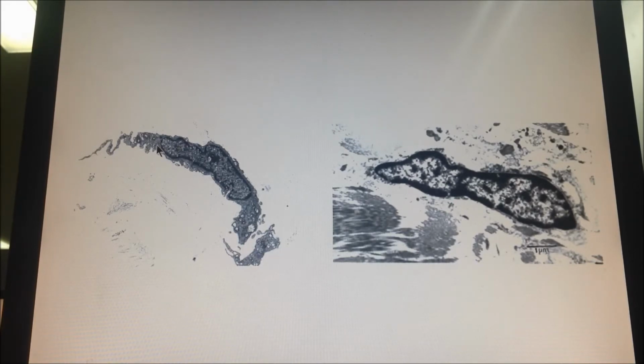فعشان هيك راح تكون السيتوبلازم فيه كل الاورجانيلز الكاركترستيك للبروتين سكريتنج سيلز. يعني راح تشوف كثير RER اكيد، راح تشوف جولجي كومبلكس كثير، وبرضه راح تشوف ميتوكوندريا. نفس الشيء هون بس less clear.